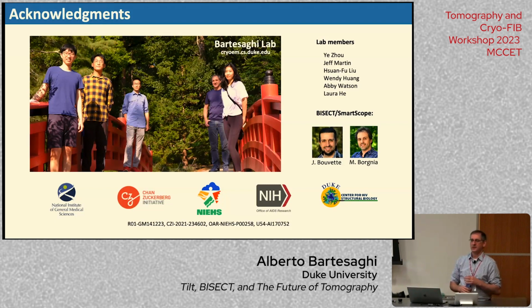Hi, that was a really great talk. And I guess my question is more focused on the pre-processing for tomography. Is it my understanding that's something that your lab is currently working on? Because you made a statement that I thought was really true, that if you can't align the tilt series, then you can't do the downstream processing.